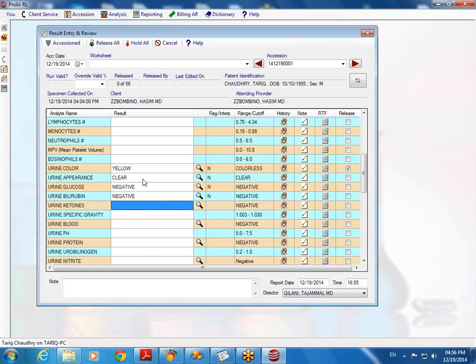So when we run our experiments in the lab, we process a batch of samples at a time, and the results are generated in a spreadsheet automatically, not something that's hand recorded. It's just the way the equipment delivers the results. So we have the legitimate and kosher way, and that is to make an interface.